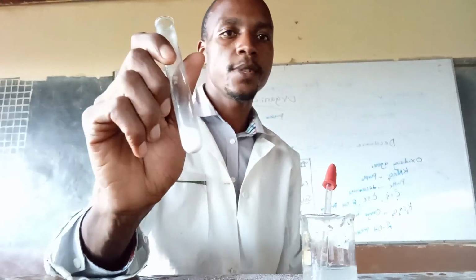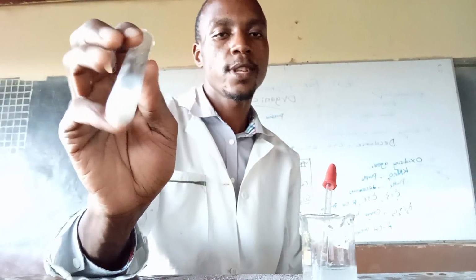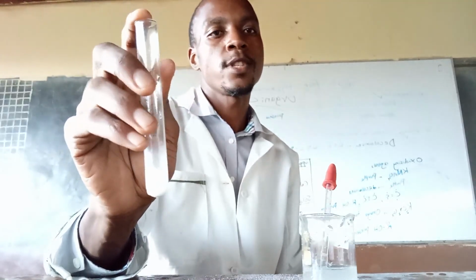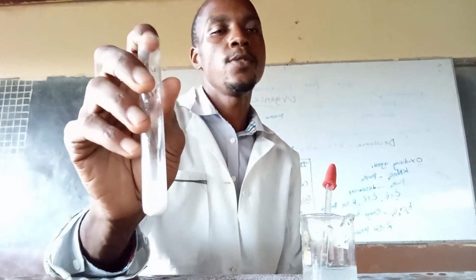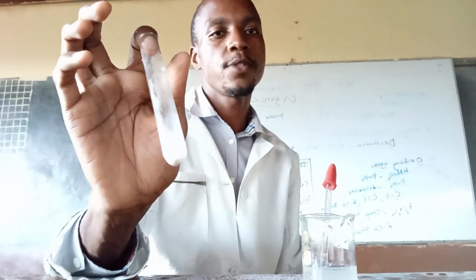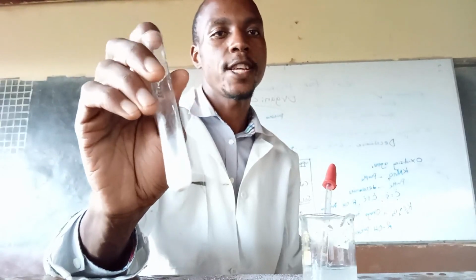If the white precipitate disappears or dissolves, then that one was a carbonate ion or it was sulfite ions. The way you separate sulfate and sulfite ions is by using an acid, any acid, and when the acid decomposes to remove the white precipitate, then that one was sulfite ions.